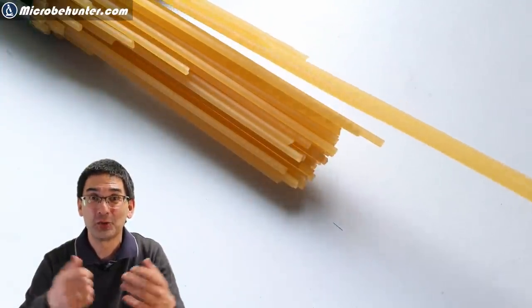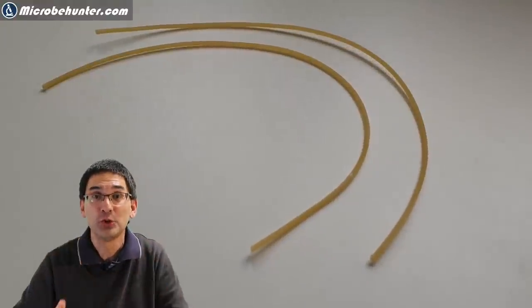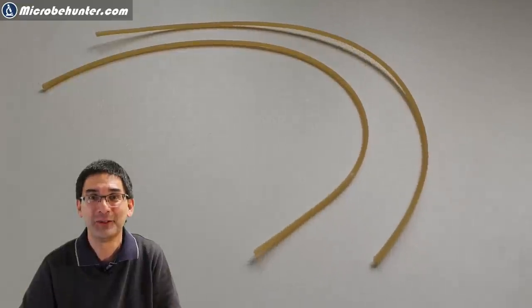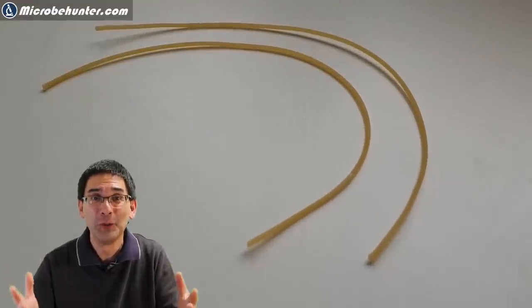And you bend them into shape and then you simply do a little bit of time lapse video like I have done and also reverse the video and it always makes it appear like it's moving and wiggling back and forth almost a little bit like those nematode worms.